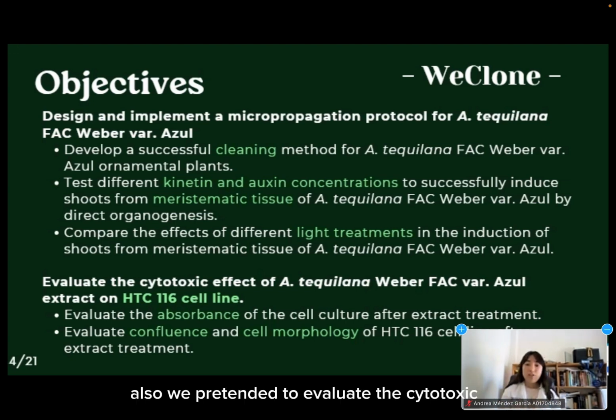Also, we intended to evaluate the cytotoxic effect of an extract from this plant on the cancerous cell line HCT116 by analyzing the absorbance, morphology, and confluence after applying the extract. All this so that we could provide our training partner WeClone with a cleaning protocol that described the steps to be followed to obtain clean explants and a proposal of an enhanced shoot induction media for further testing.